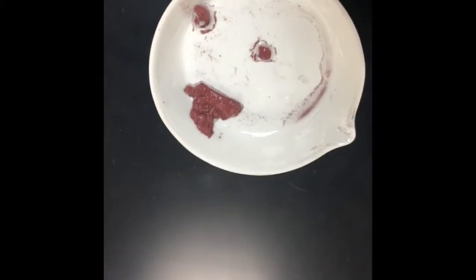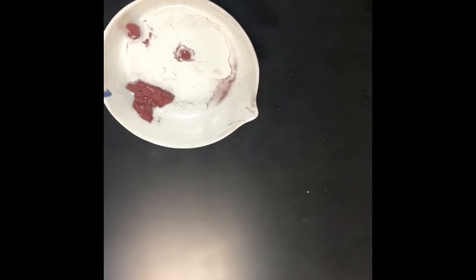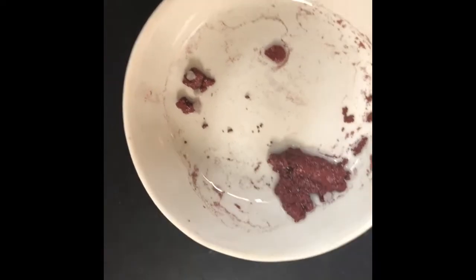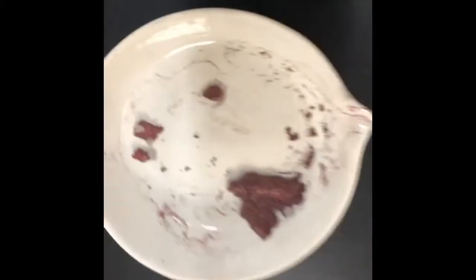So I've transferred my product to the porcelain evaporating dish, and the first wash we're going to do is with about 5 milliliters of water. Okay? So we're going to switch hands. We'll wash our product, and then we're going to pour it off. Wash my product with methanol and acetone, and I've decanted it. So now we're ready to go to the oven.